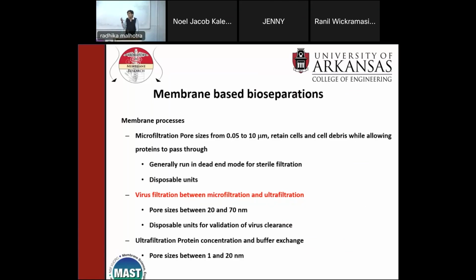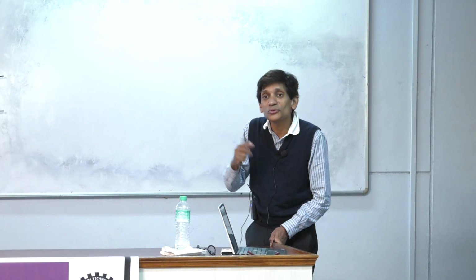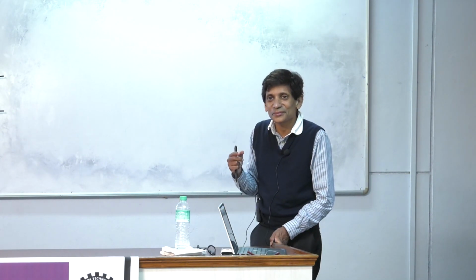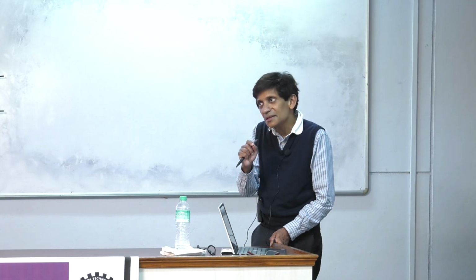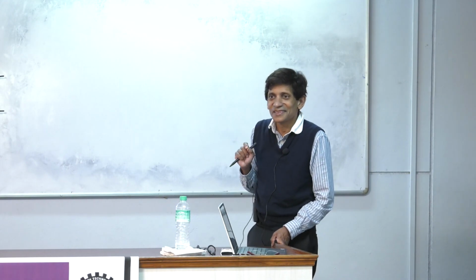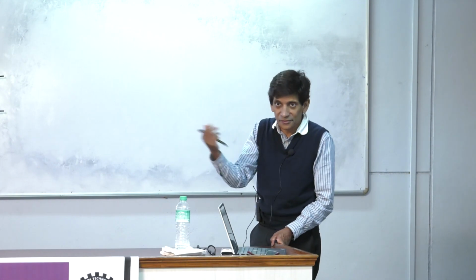Correct. Remove micron-sized things, right? Ultrafiltration, what are we trying to do? What do you want to do with proteins? Yes. Can you be more specific? Concentration, yes, or removing the buffer, diafiltration.